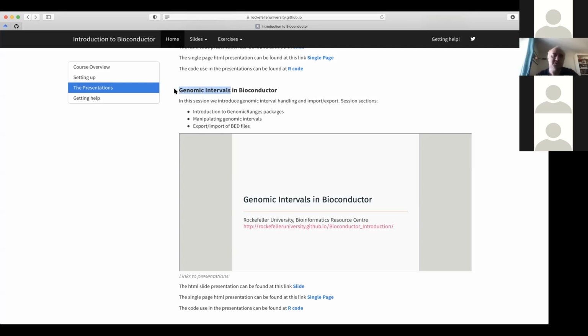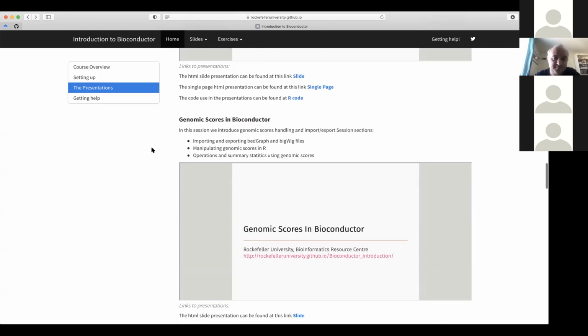So this got us going on how we start to work with genomic positions, genomic intervals. Then, to add to that, we have genomic intervals with some type of association of a score, and these become our genomic scores. Often we will see these in things like bedGraphs and bigWig files. This is what we want to look at in IGV, this kind of graph track. Also wiggle files, because they're a wiggle, right? They're a graph. We saw that we can import these from pre-compiled scores, things like bigWigs and bedGraphs. We can import them, we can manipulate them.